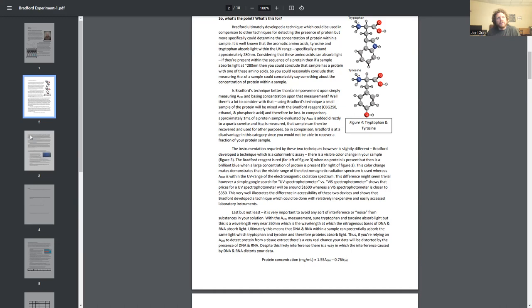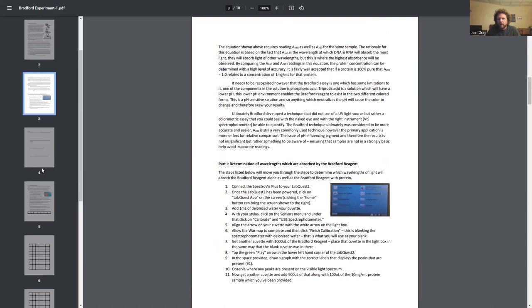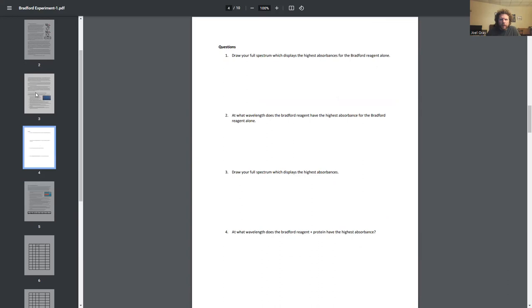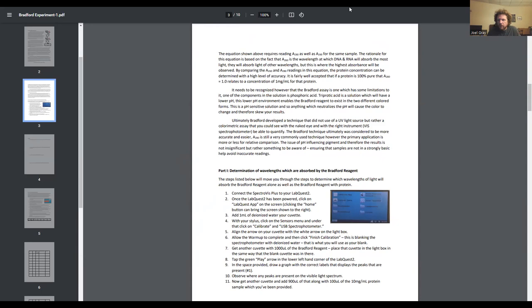Okay, so what you're first going to do in this experiment is figure out what wavelength is your lambda max. So what is the wavelength that gives you the highest absorbance level? I'll give you a little bit of a spoiler: the wavelength is within the visible light spectrum. And so what you're going to do in order to figure this out is put a solution together that consists of, on the next page here, sorry.